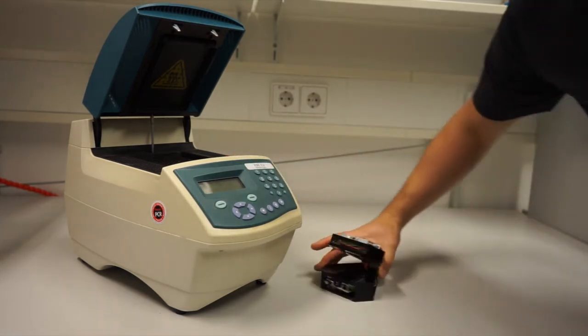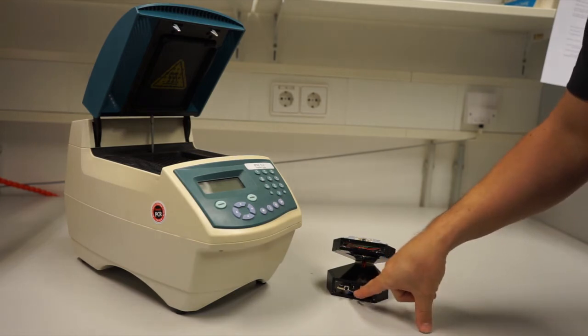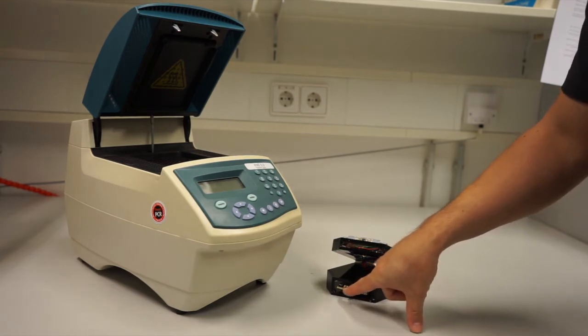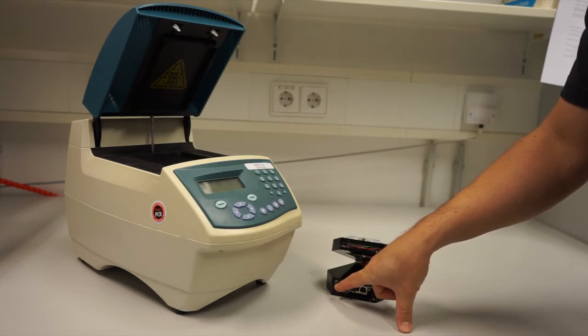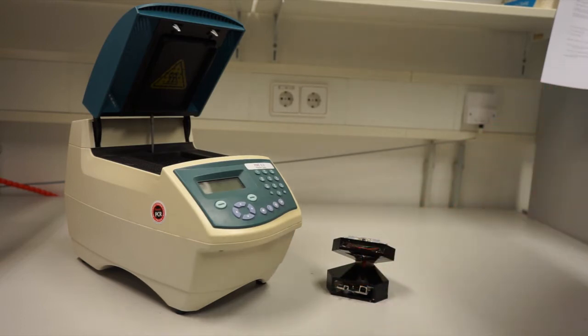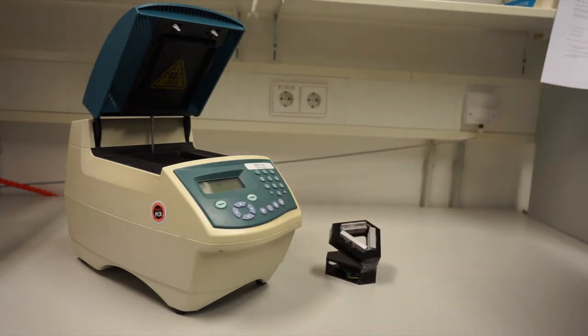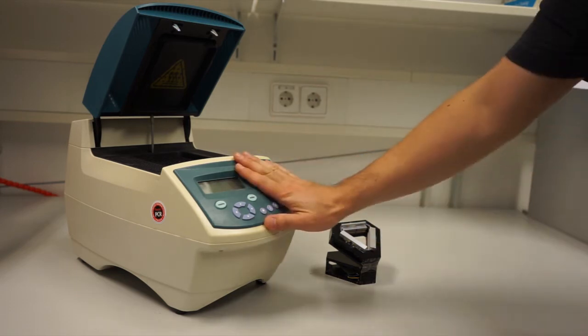On the back of the Polymerase chain reactor, we have our USB control, a power input, a power select switch, a reset switch for reprogramming the device, and inside is a Bluetooth dongle which lets us connect to the computer. The device is so much cheaper because there isn't an expensive interface. Everything's done on the computer over the Bluetooth connection.